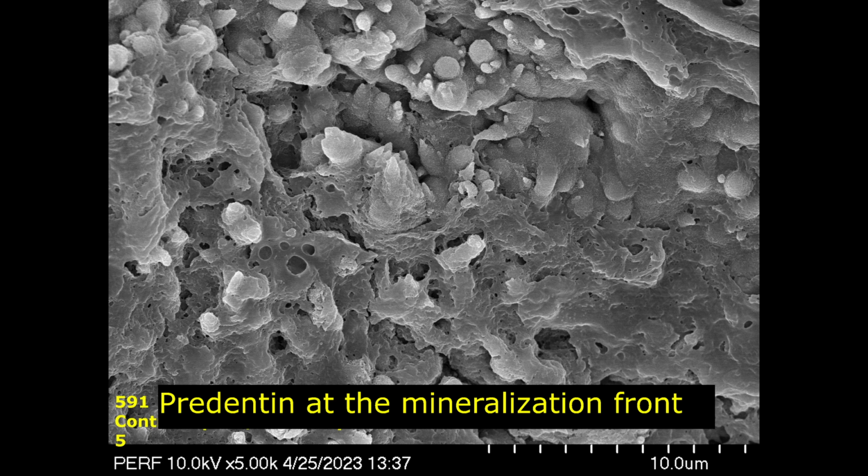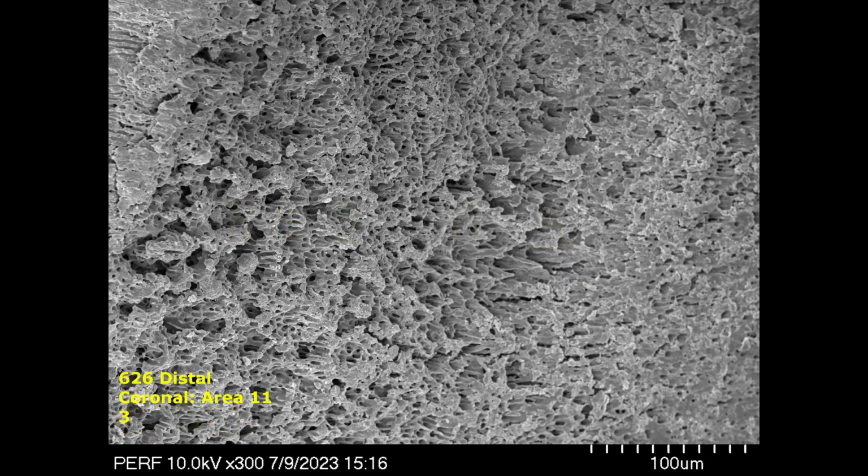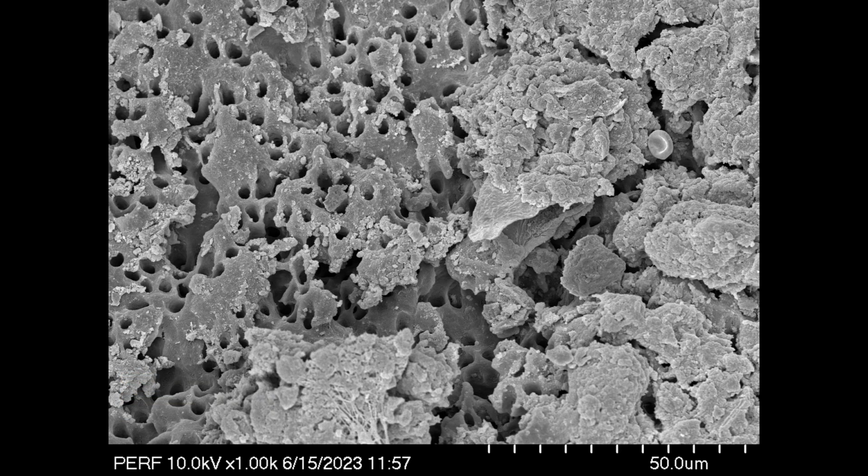Now, when we zoom into areas, the actual structure of the predentin and the effects of the dehydration and precipitation of the predentin proteins give you more context in what these structures represent. I hope this clumsy attempt to put some of these issues in clearer context will help you as you grow your pattern recognition skills in SEM interpretation.